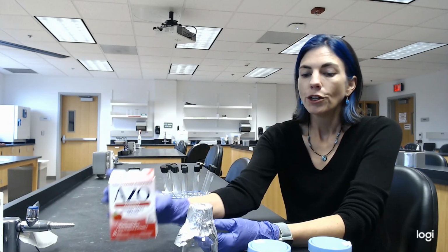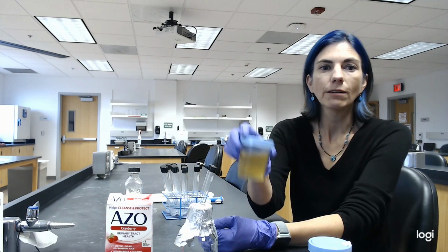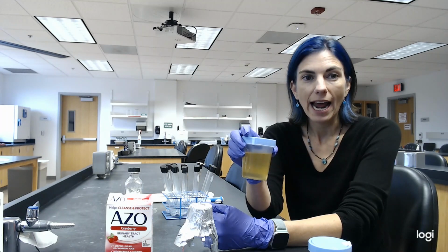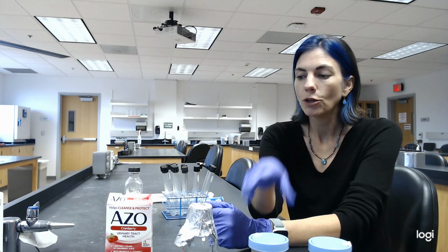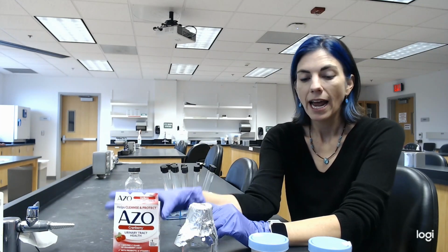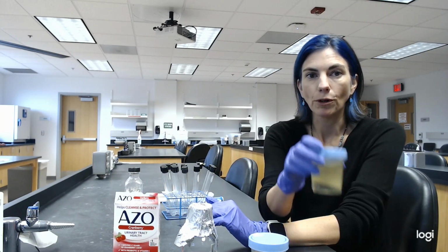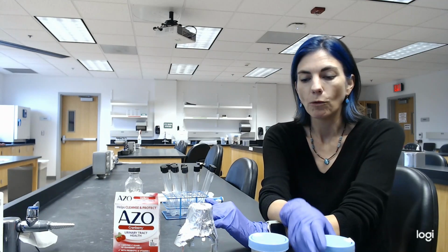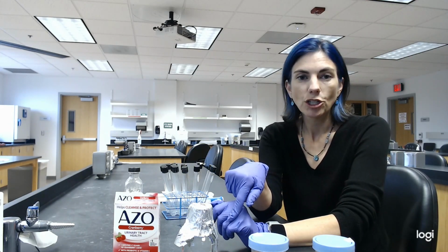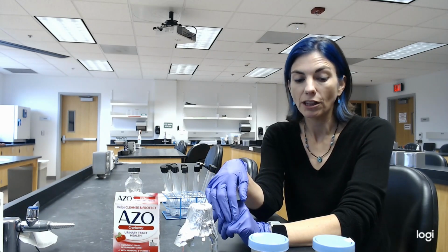So what I have here is a urine sample that was taken yesterday by me prior to taking any Azo. Then I took a dose of Azo last night and then another one this morning. And then I just took a second urine sample a little bit ago, which gives me about 4 hours after I took my last dose of Azo. That should be enough time to make it into the urine.